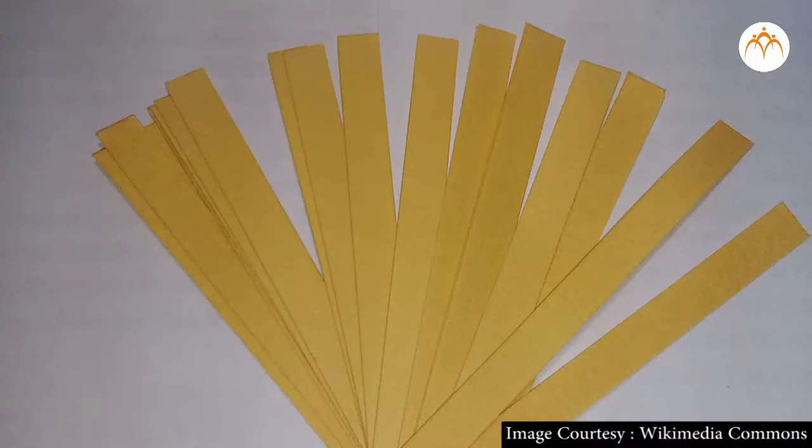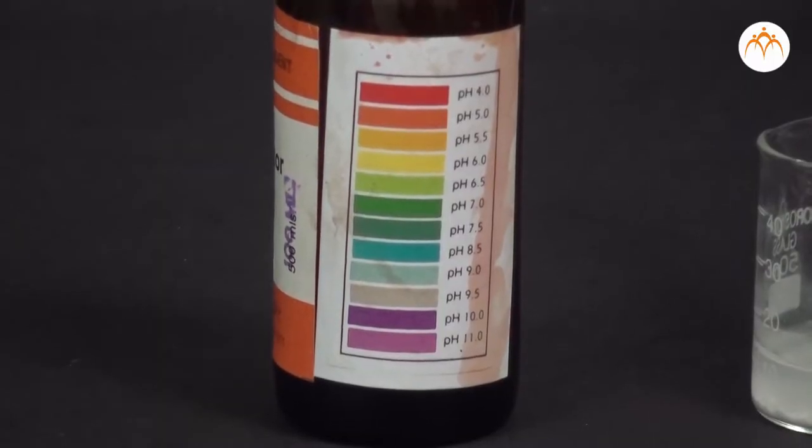By using pH paper, universal indicator, or pH meter we can measure pH of any aqueous solution. Color change helps us to measure pH of a solution.